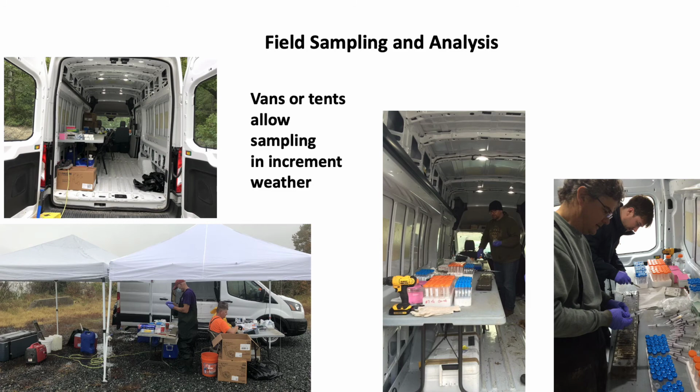The sampling is going to be covered in the next slide. This is just basically an overview of a field deployment. You can see the sample bottles have been pre-positioned to allow rapid sampling. There is a screw gun to be able to remove the cover plates if required. Syringes are available for each sample cell, and with 2 people it normally takes about 30 minutes to sample the equilibrium cells and 45 minutes to sample the sampler, including the SPME fibers, equilibrium cells, biosep beads, and velocity cells.